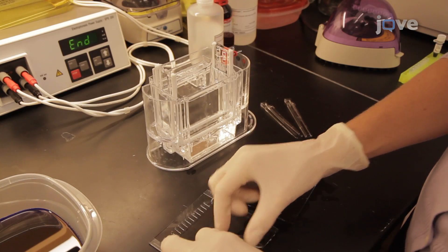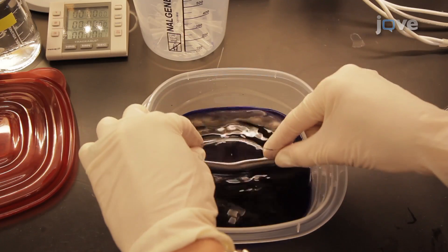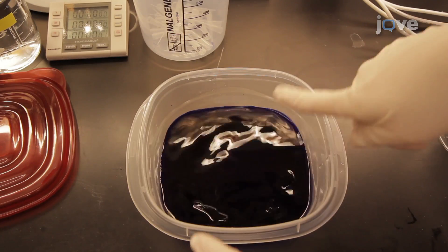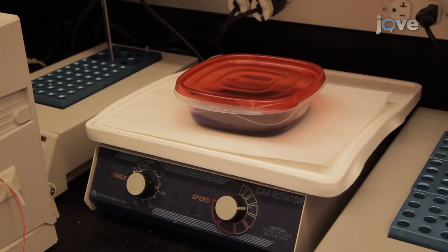When the gel has finished running, remove the gel from the cast and place it in a small plastic box with enough Coomassie Blue Stain to cover the gel. Stain the gel for 1 hour with gentle agitation.